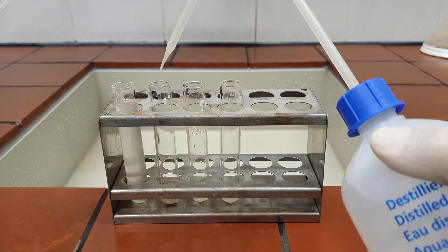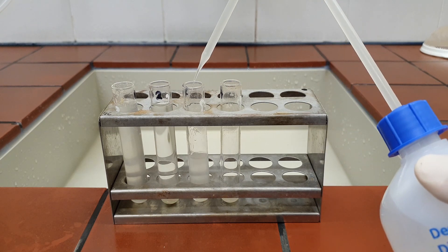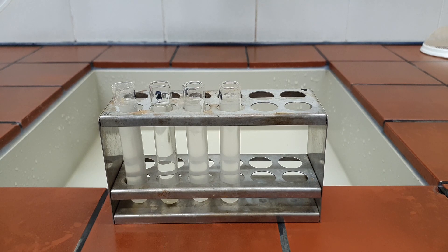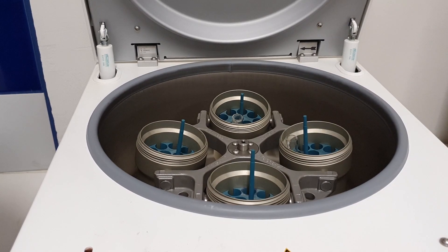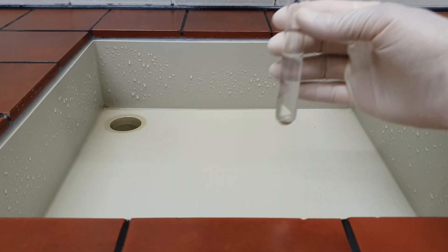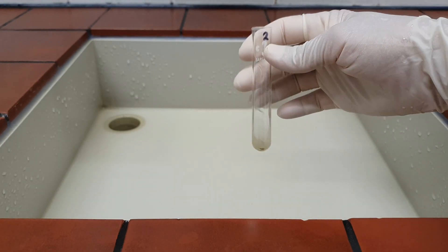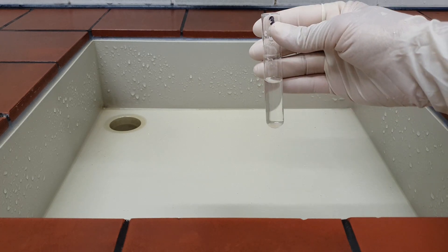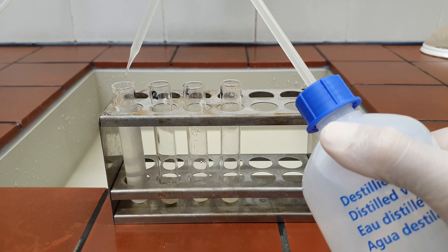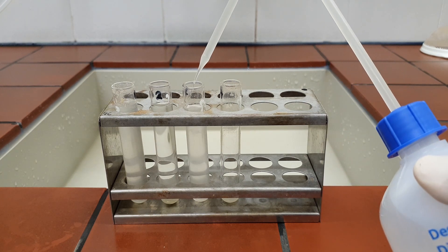In the last step, rinse the diatom suspension 3 times with distilled water to remove any chemicals from the sample. In order to do this, centrifuge the samples at 2000 rpm for 3 minutes, decant the supernatant, add distilled water, and repeat the procedure again.